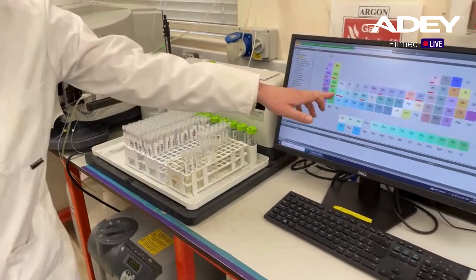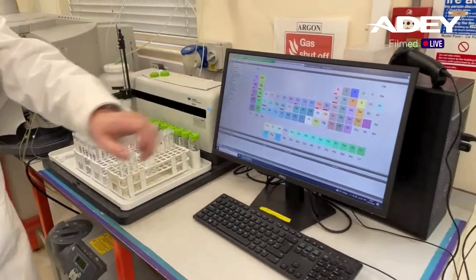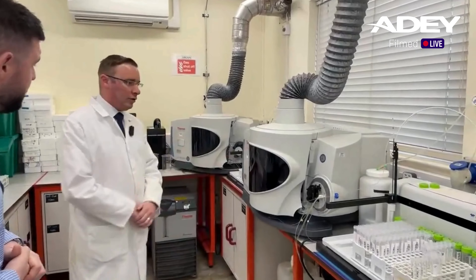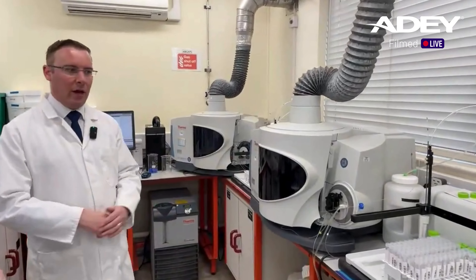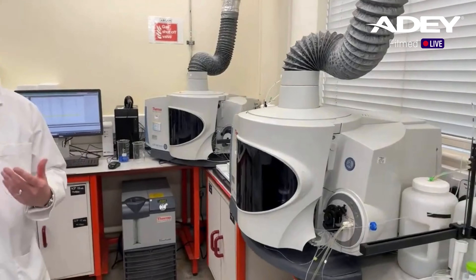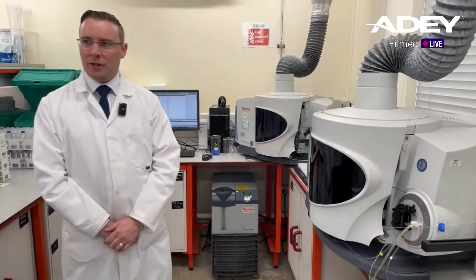Each metal emits light at a characteristic wavelength that only it will have. We've also got a second instrument to allow us to have that high capacity throughput and speed of service that our customers are expecting. It doesn't look like cheap equipment either, Josh. No, it's certainly not cheap equipment - that is for sure.